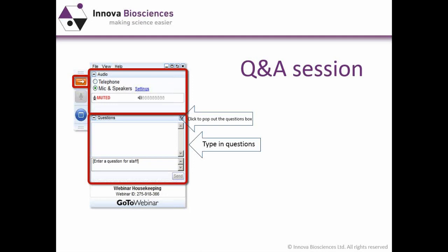Our next question is, can the one-step conjugation kit be used with proteins, not antibodies? Yeah, I did say in the talk that the kit was for antibodies. It can be used with proteins. We've done the optimization for antibodies, but as long as your protein has lysines, then in principle, yes, it can be used. You may need to try different amounts of protein to optimize the system.